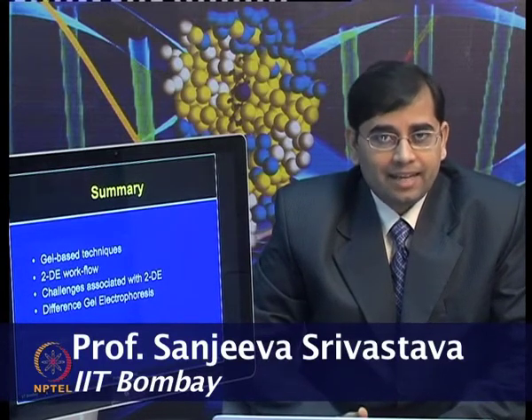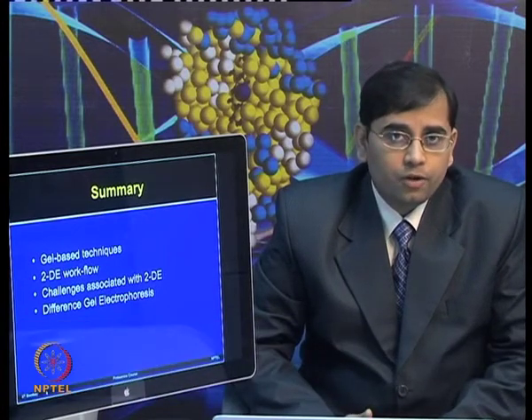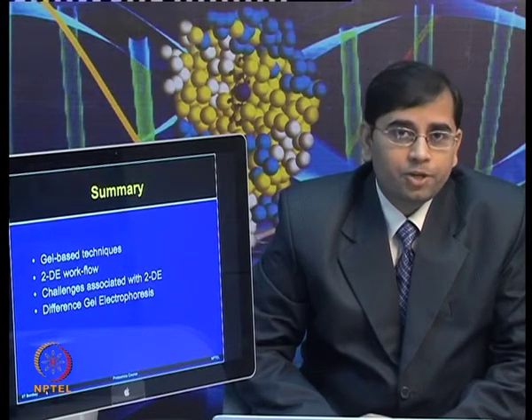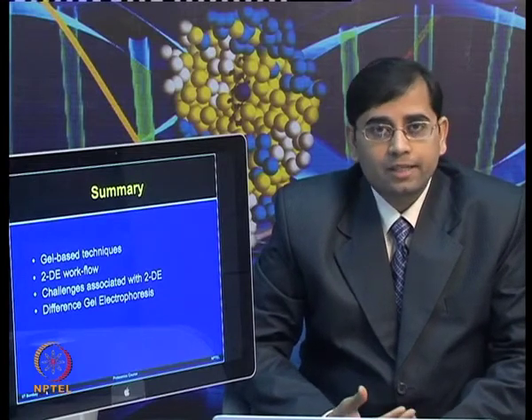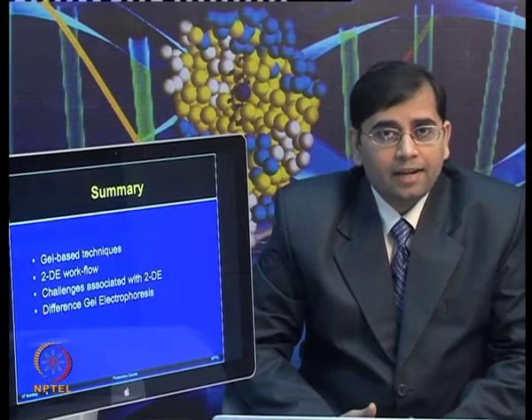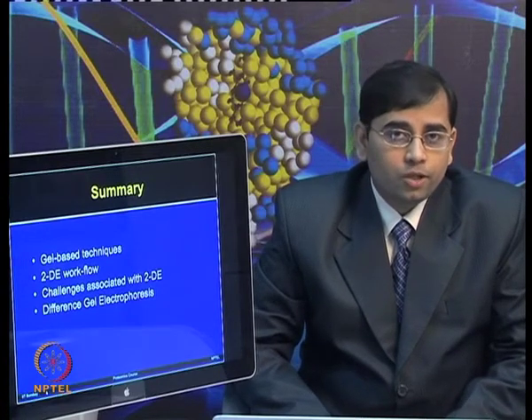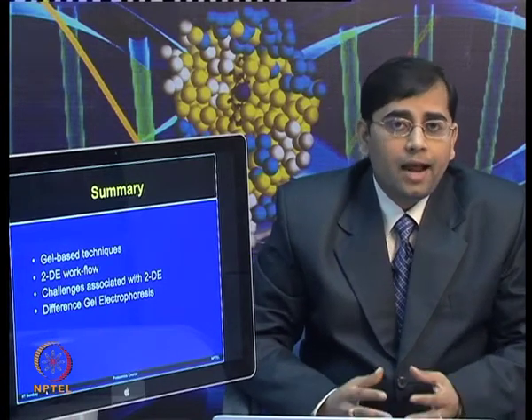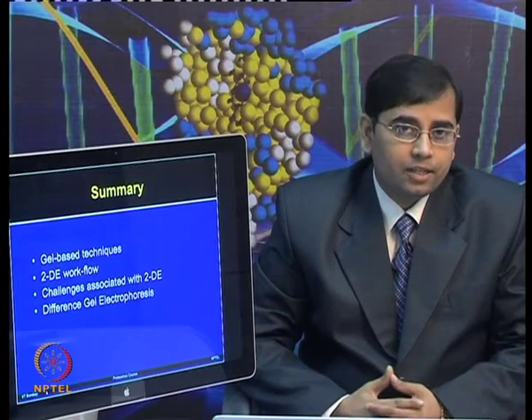So I hope our discussion with Dr. Srinivas was useful, and now you can perform these analyses by using specialized software and obtain some very useful biological information from your data set. You must appreciate that a lot of meticulous steps are involved in performing these experiments, but in the end this provides a very useful quantitative multiplexing approach to separate proteins and to analyze different types of variations.